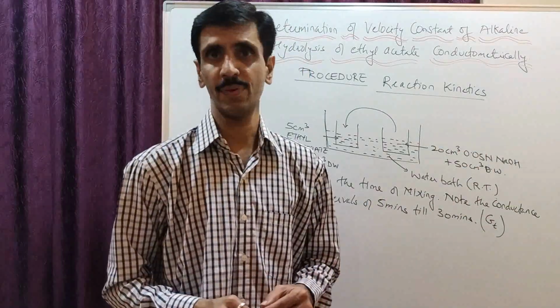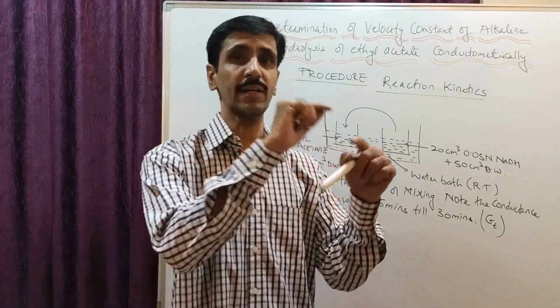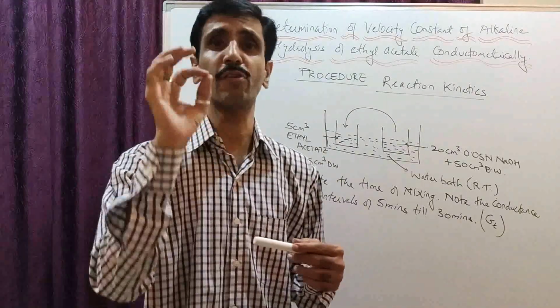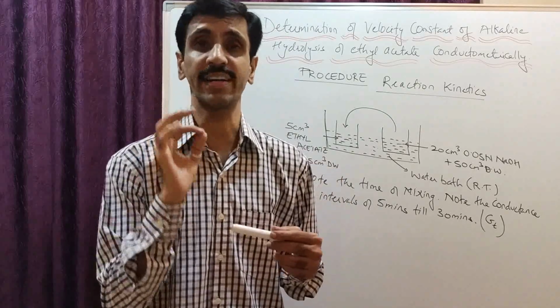If you remember, when I was explaining the theoretical background, I gave you the formula of the velocity constant for the second order reaction.